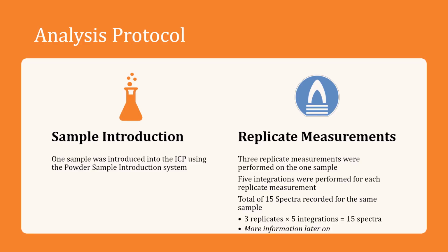The sample introduction system was the powder sample introduction that we saw previously. I did 3 replicate measurements, and for each replicate measurement there were 5 integrations. That means that there's a total of 15 spectra for each sample, for each analyte. More information a bit later on.